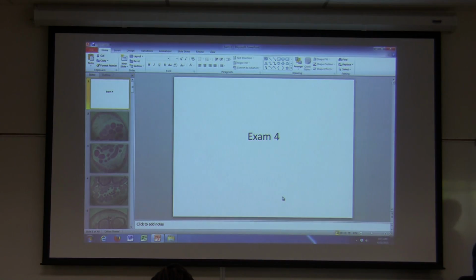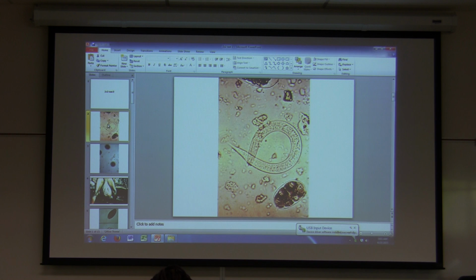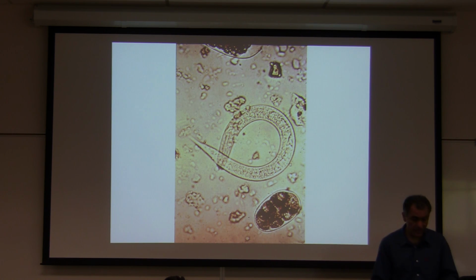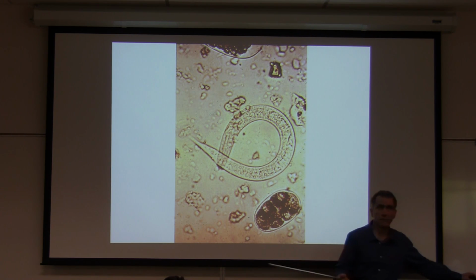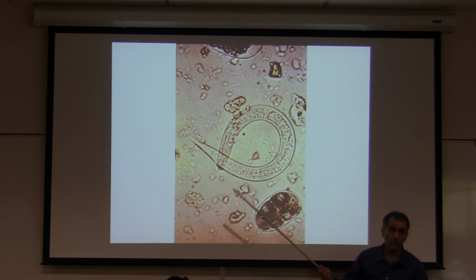Okay, let's go look at 2x2s. 2x2s, you know where they are, you know everything about them. 2x2, I hope this is the right one. Yes. Okay. I didn't talk about this in your lecture notes, but again, you should know something about it for lecture material. What is the name of the organism?